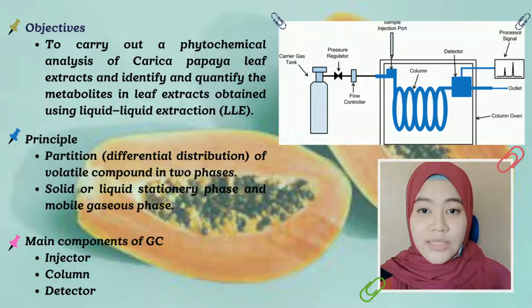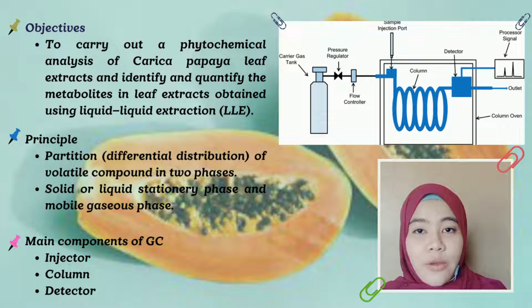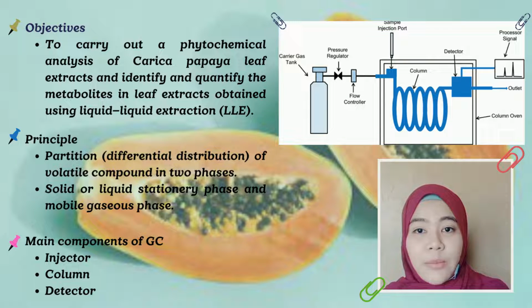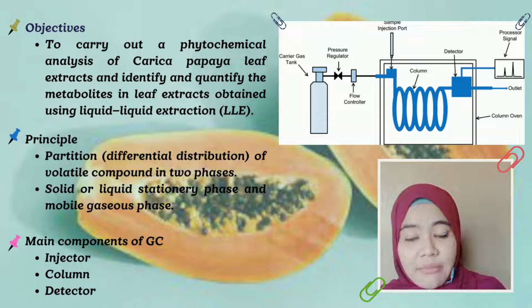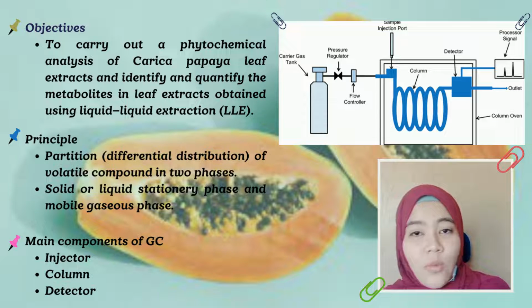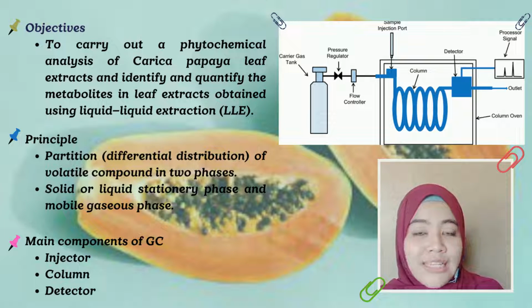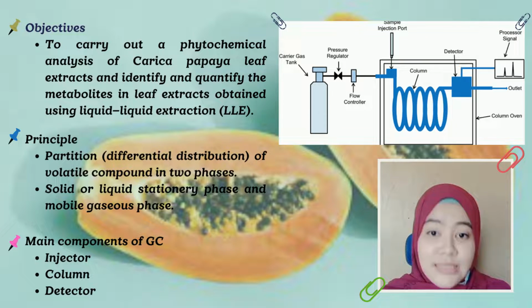phase and stationary phase. Next, the elution order in gas-liquid chromatography depends on the boiling point of the solutes and the interaction between solutes and the stationary phase. If mixture components have significantly different boiling points, then the choice of stationary phase is less critical. But if two solutes have similar boiling points, then separation is possible if the stationary phase interacts with one of the two. Non-polar solutes separate more easily when using a non-polar stationary phase, and the same goes for the reverse.